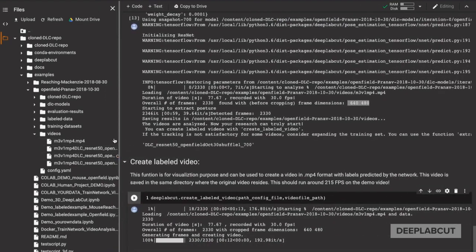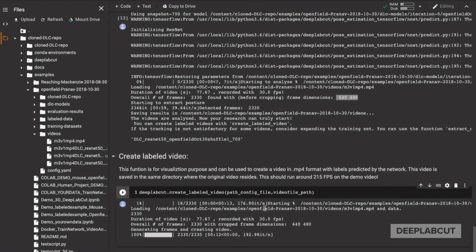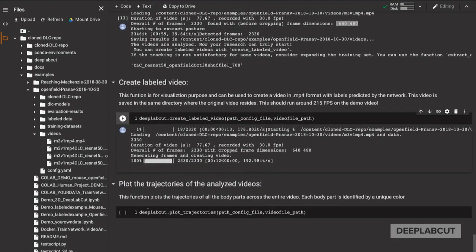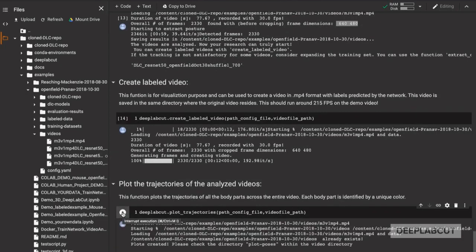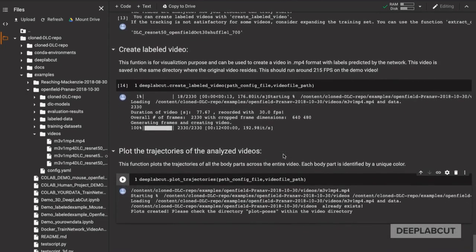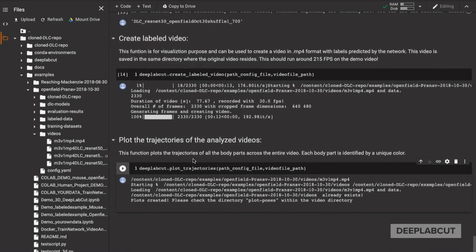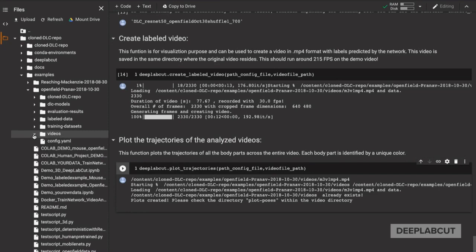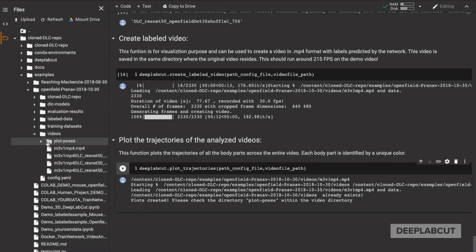You can also create labeled videos. A key point will be the level of P-cutoff that you set. The default in this example is 0.4, which is relatively low. For your normal datasets, you're going to want to edit the config file and set this to about 0.8 or 0.9.